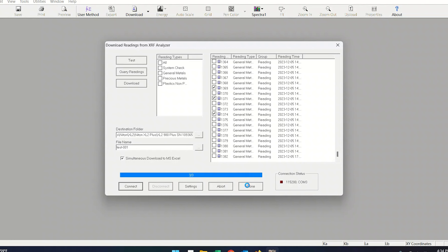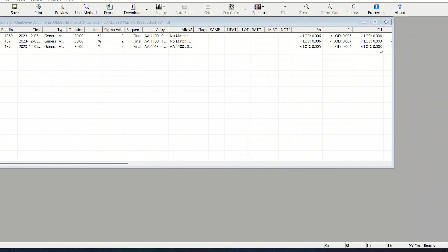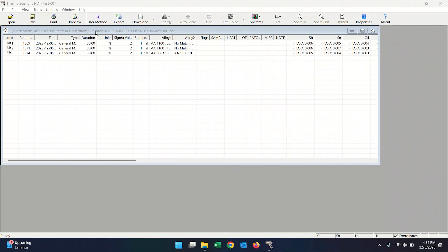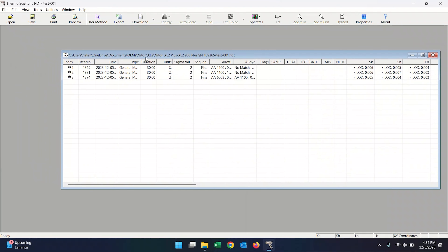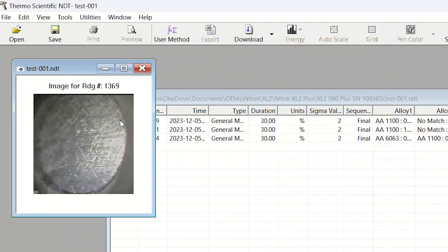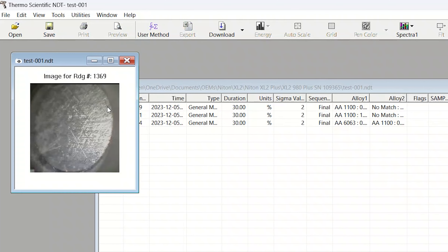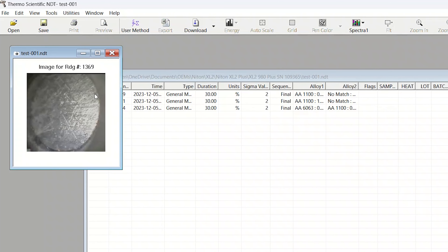Now we're going to hit download. You can see it takes no time at all — it downloads all those files and then we hit done. Our data pops up and at the bottom of my screen you'll see this test001 Excel spreadsheet. I'm going to close this — it downloaded to the same destination as the NDT file we just saved. Over here we have all of our data in the NDT software. You can click this little camera icon to show a picture of the sample surface, which is useful to confirm you didn't miss the sample. Note that the image does not port over into the CSV file, so it's good to have both file types. You can also view the elemental breakdown of the samples from here.